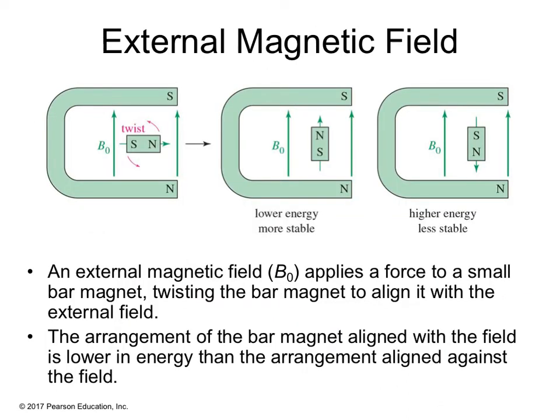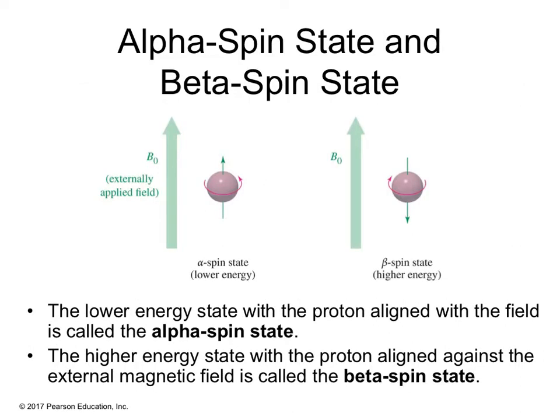And so when you put this spinning, it's a little magnet. So when you put this little magnet, which is your compound with the 1 proton, and you're spinning it, and it's creating this magnetic field, and then you put it in a larger magnetic field, then you can create a spectrum.